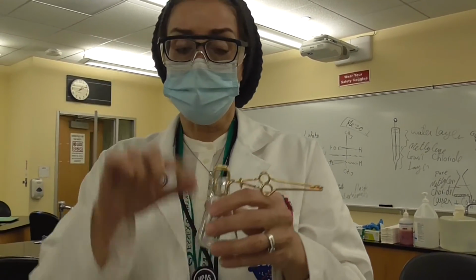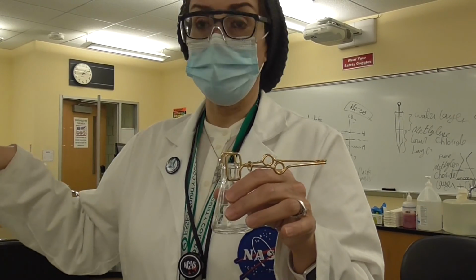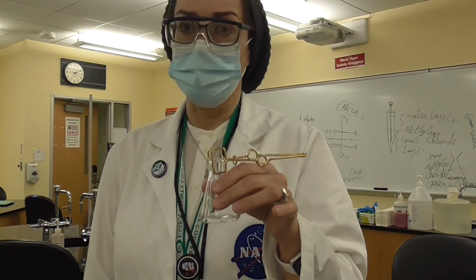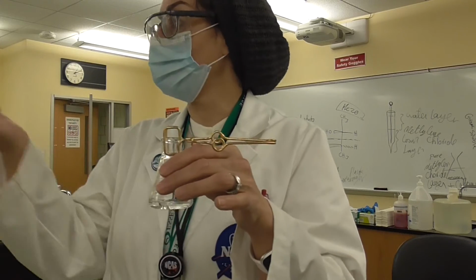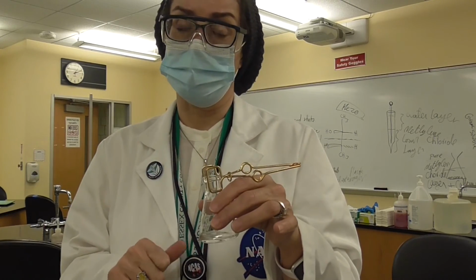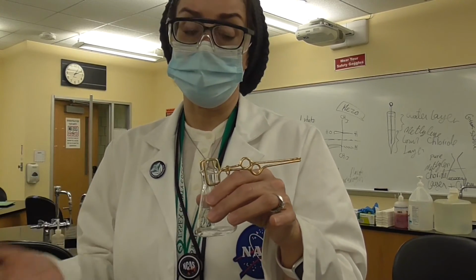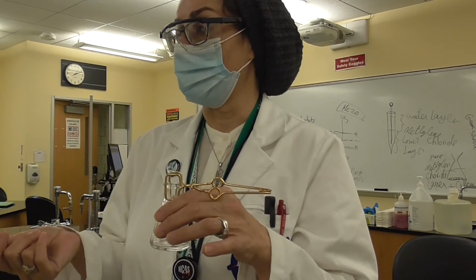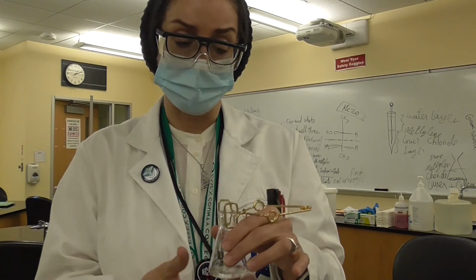Therefore, the heating is going to be conducted under the hood, on the hot plate, on top of the water bath, not directly on the hot plate, because it could catch fire. You have to be very careful with methylene chloride or ether as well, diethyl ether or methyl ether, because those are flammable and could burst into fire if put on any hot plates.